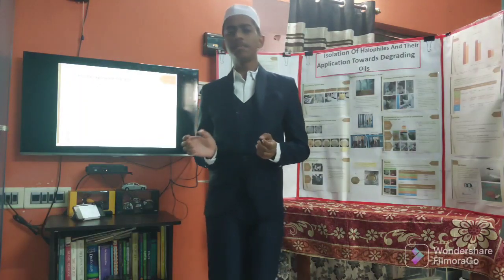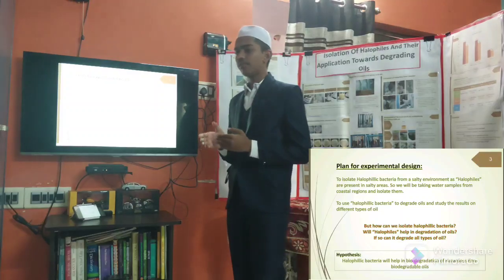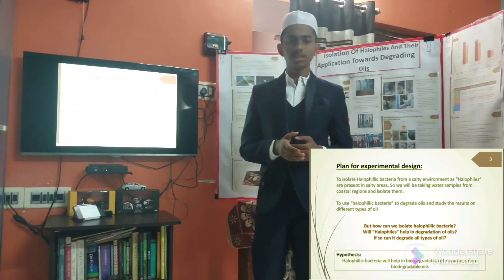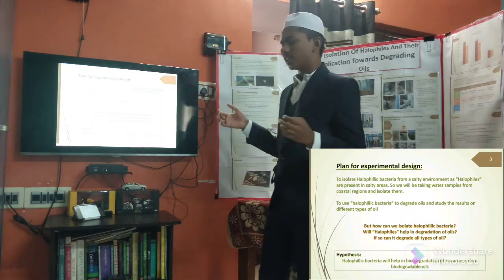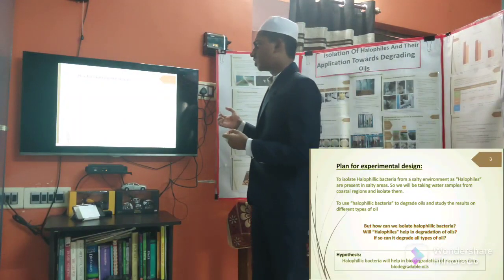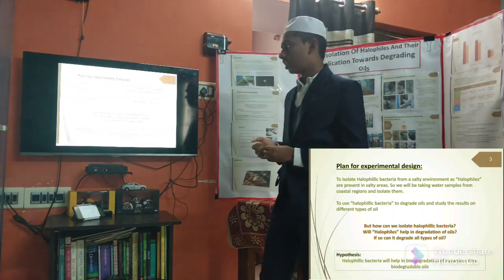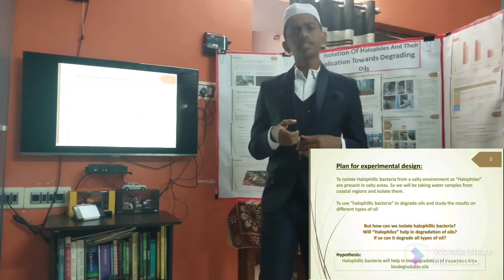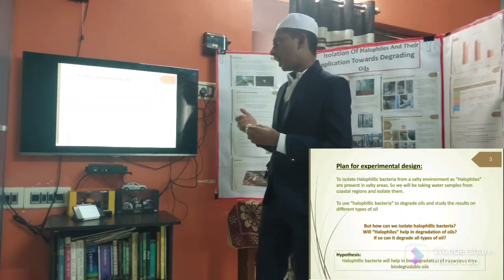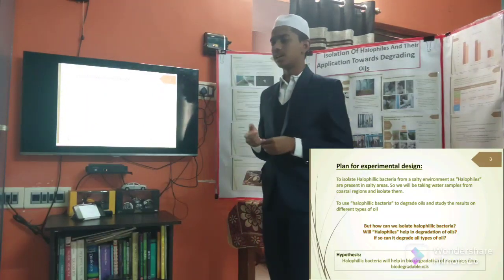The plan for experimental design. First of all, we are going to isolate these halophilic bacteria from salty environments like oceans, and then we are going to apply them on oils. So first, the research questions are, how can we isolate these halophilic bacteria? Will halophiles help in degradation of oils? If so, can it degrade all types of oils? The hypothesis of the project is halophilic bacteria will help in biodegradation of hazardous oil contents.